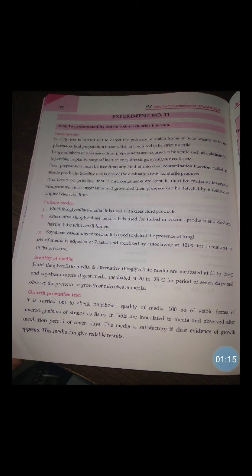As I discussed earlier, sterile means free from all types of microorganisms. The sterility test is one of the evaluation tests for sterile products. It is based on the principle that if microorganisms are kept in nutritive media at a favorable temperature, they will grow, and their presence can be detected by turbidity in the originally clear medium.